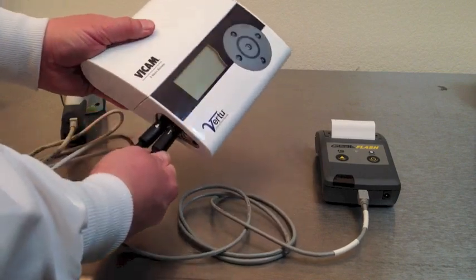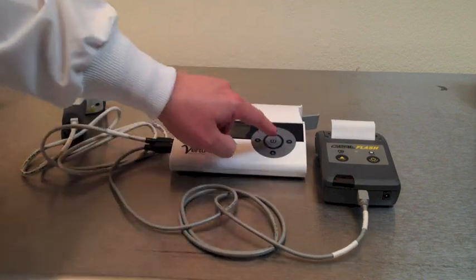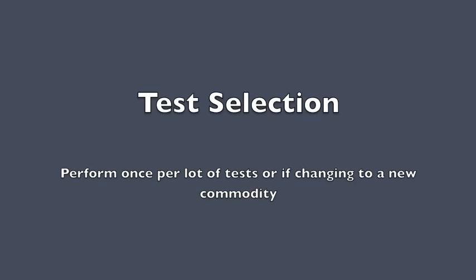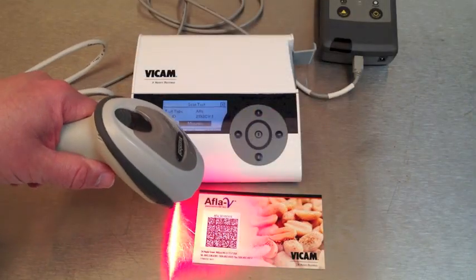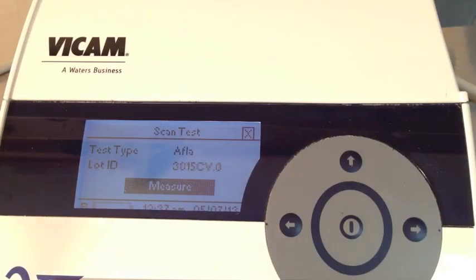You'll also see a power supply on the side of the Vertu. The Vertu system is capable of testing many different commodities. Keep a copy of the AFLA-V instruction guide by you in order to follow along with the test. The barcode is unique to the lot of strip tests. Hold the barcode scanner at a 45-degree angle to the barcode and pull the trigger. You will see the display change the lot ID and the test type.